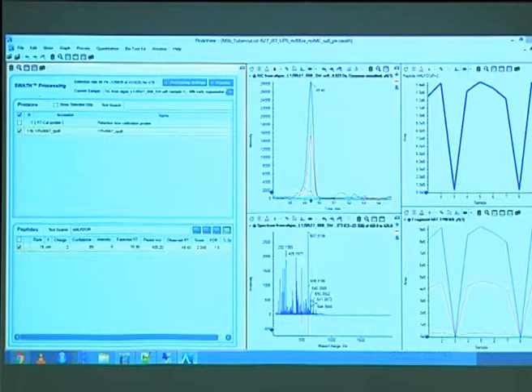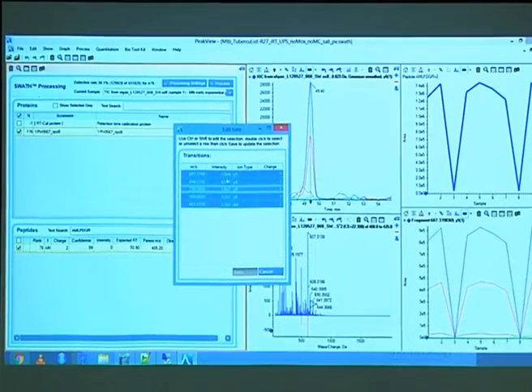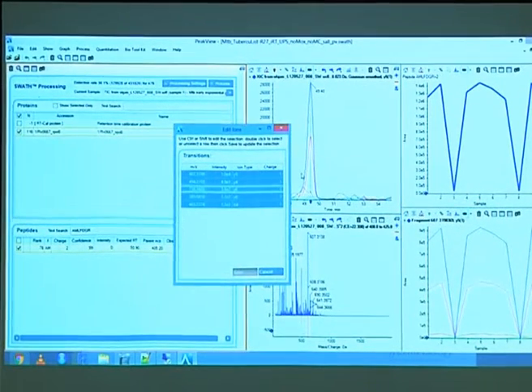And what happened in that case is, if you look in the ions file, when you sort by intensity, you actually see the top two. This is like 1E4 and about 5E3, which agrees well with this one here. That one is about twice as high as that one. But the other two are very small, and they're supposed to be very small. So they're like 3.5E2, so that should be 10 times lower than this one. And so there you might run into trouble, in that you don't identify three of the transitions, you only have two.